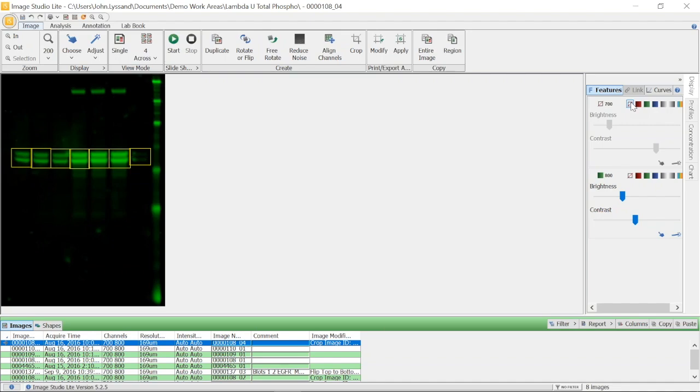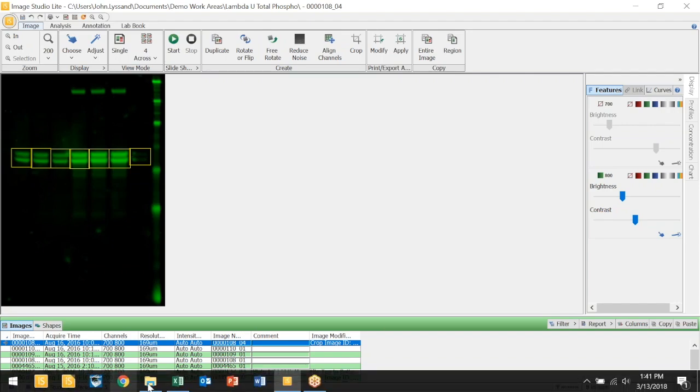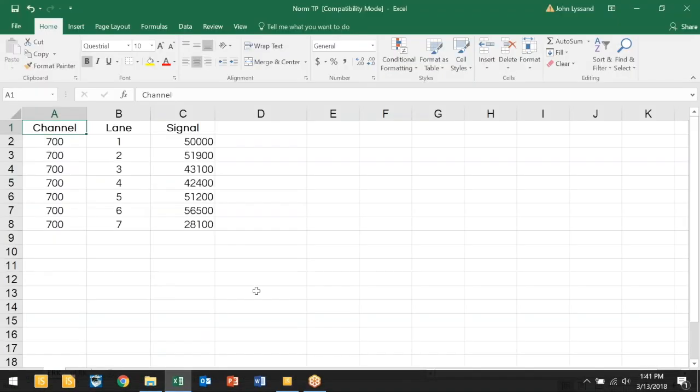Once you've quantified in Image Studio Lite, we'll want to take our data and export it to a graphing program. Here, I've exported this dataset into Microsoft Excel.